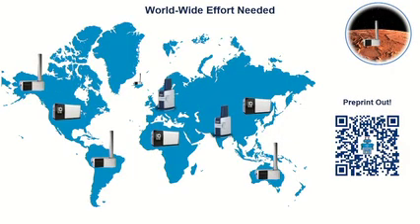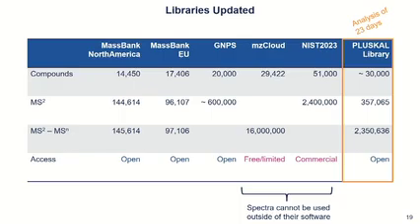And this is something I want to stress. It's a worldwide effort, so everyone who's acquiring reference standards should definitely be open, or if possible, share your data publicly. And you see, the world is big. We have so many groups working on so many different topics and research fields. So that's why, definitely, if you acquire reference data, feel free to upload it and share it with other people.